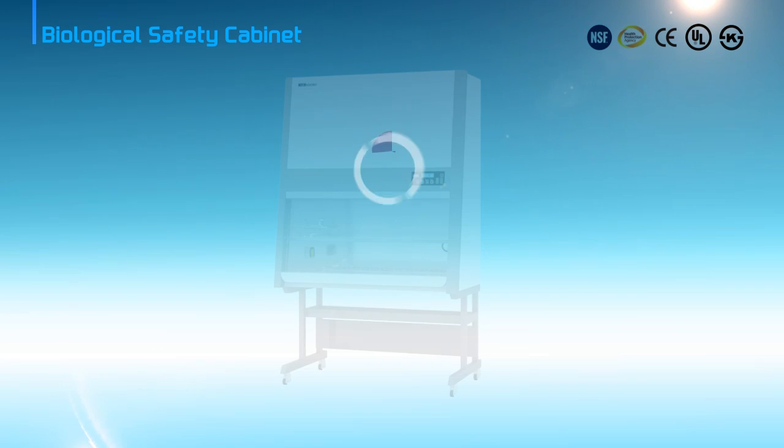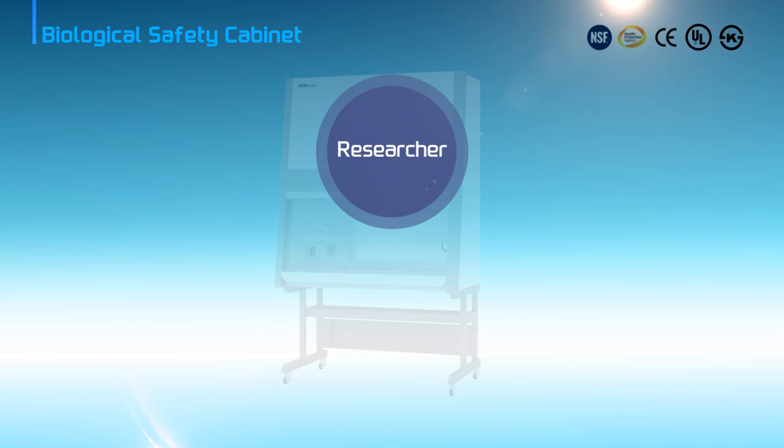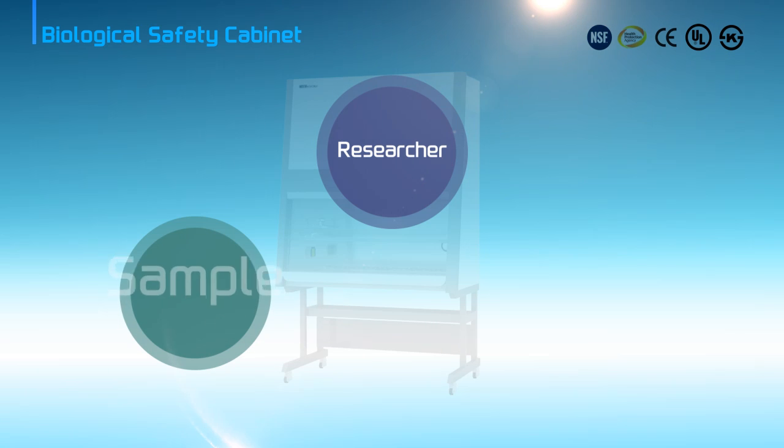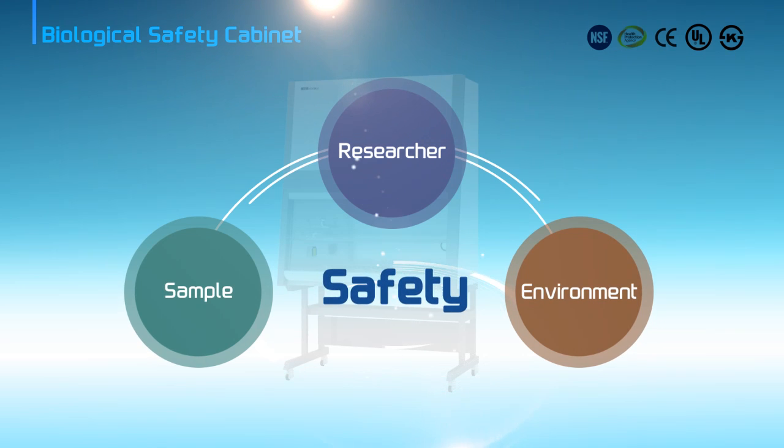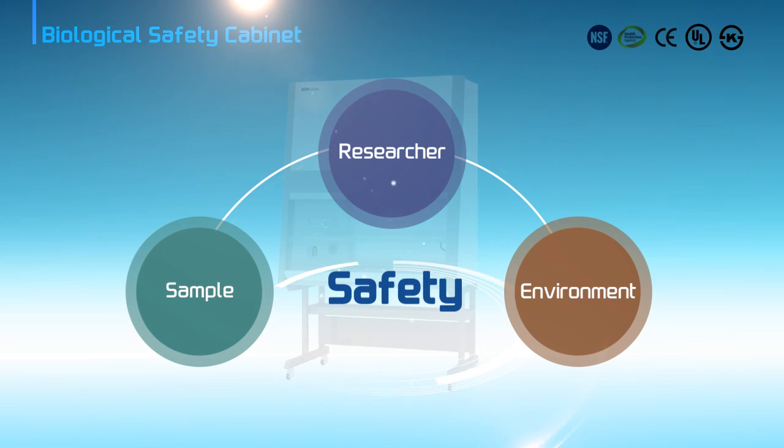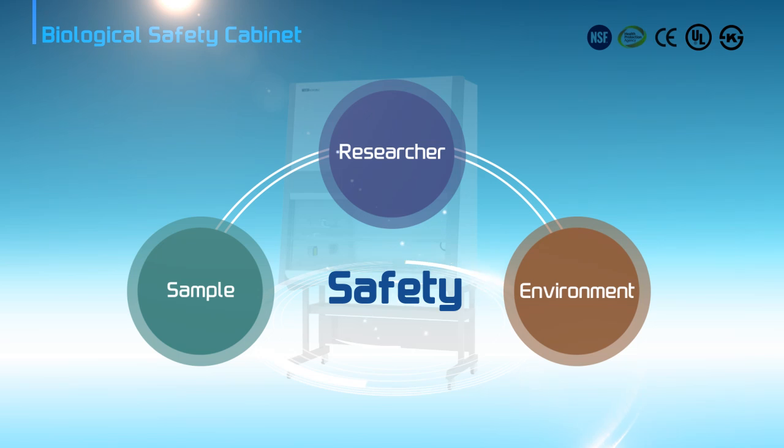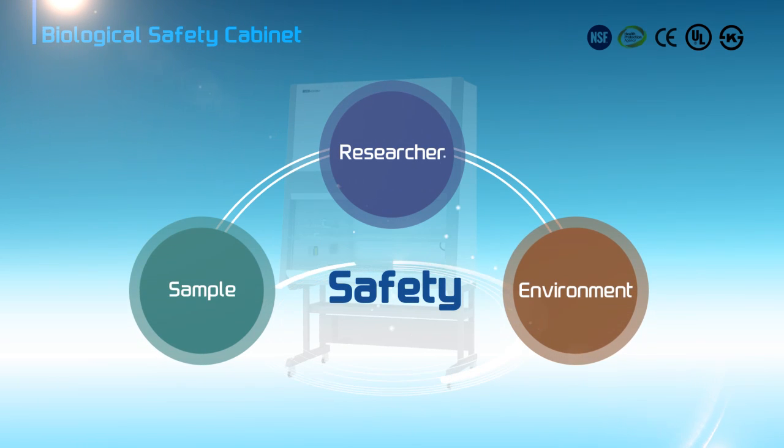CHC Lab Biological Safety Cabinet provides three protections: safety of researcher, safety of sample, and safety of environment. It is also certified by international standards NSF 49 and EN 12469.